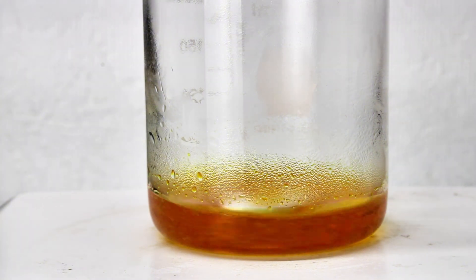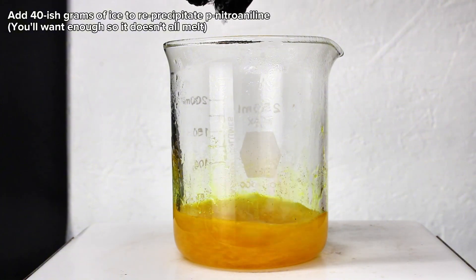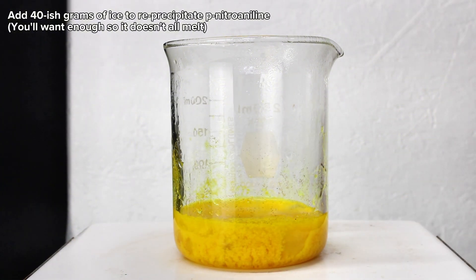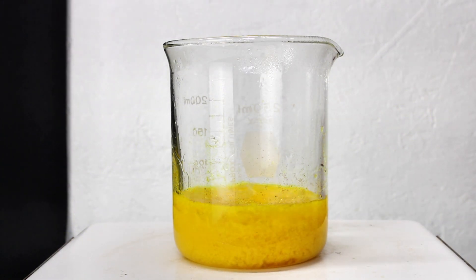After a bit of heating and stirring, the para-nitroaniline was completely dissolved, and then I added around 45 grams of ice, which re-precipitated the para-nitroaniline as a fine suspension. Most of the ice melted here, but there should be at least a little left to assure that the reaction mixture is sufficiently cold.